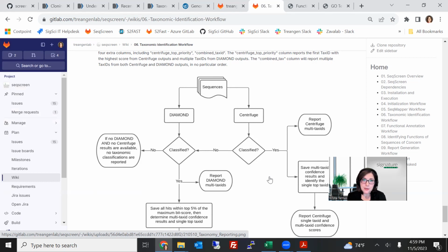And we needed to pick a decision path here to consistently have our software give answers in a uniform way. But we included all these different results in here so that you would have more information as a user, so that if one tool did not give you a very confident result, you could always go back and look at the other one. So that's the high level rationale here. And hopefully that helps clarify things.